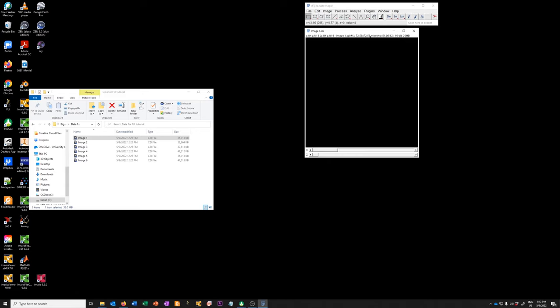To burn the scale bar into the image, use the Flatten command. I never remember where it is, so search for 'flatten' — it's Image > Overlay > Flatten. Running it creates a new image where the scale bar has been burned in. You can tell because if you zoom in, the scale bar now looks like pixels rather than a floating object. Save this as 'sb_flatten' and when you double-click it in Windows Explorer, the scale bar is nicely present in the image.